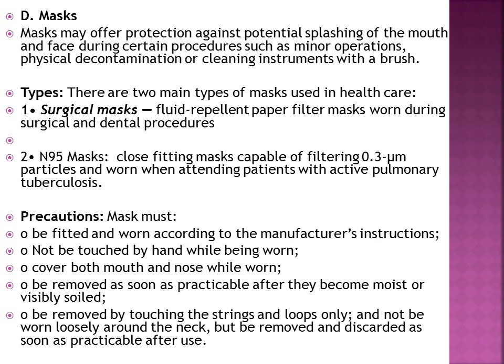So now what are the precautions? They should be fitted and worn according to the instructions, not touched by hand while being worn. They should cover both mouth and nose, and should be removed as soon as possible if they become moist or spoiled. Remove them by touching the straps, not by touching the mask. And then hand hygiene should be done after removing the mask.